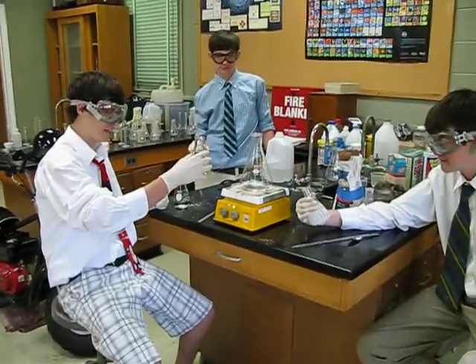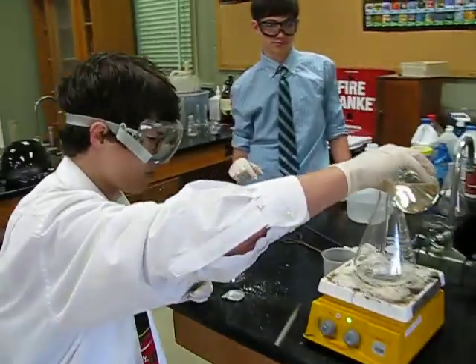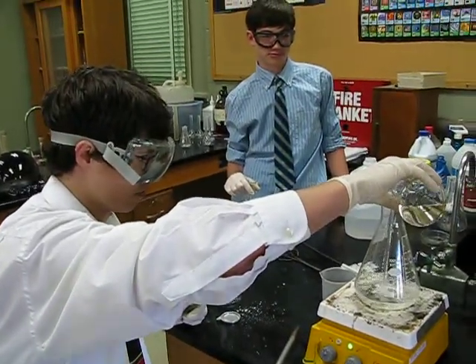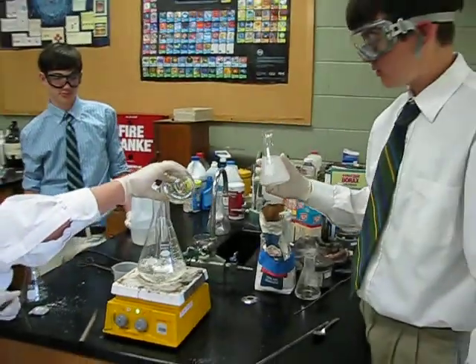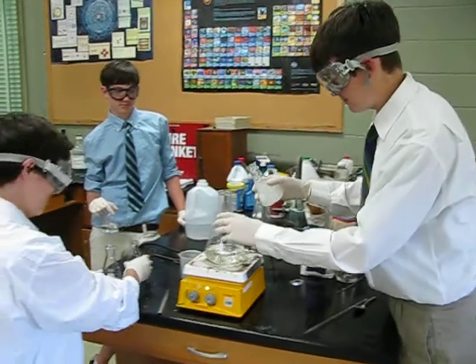In solution A, we've got potassium iodate and sulfuric acid in water. In solution B, we have starch, manganese sulfate monohydrate, and malonic acid.